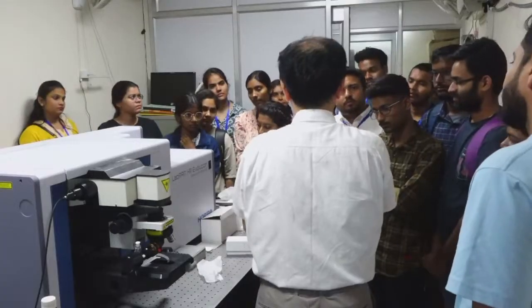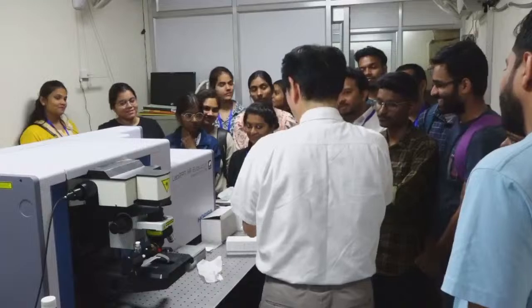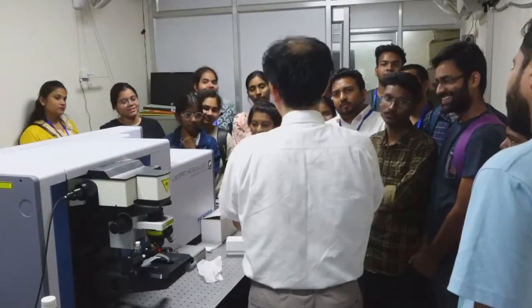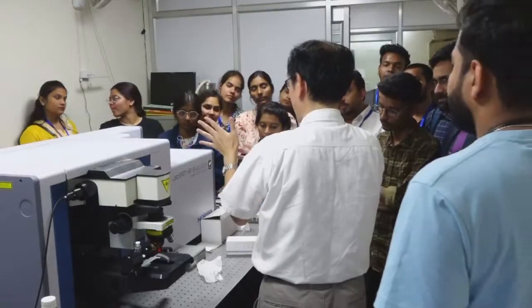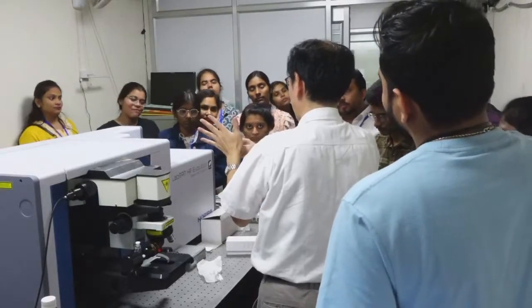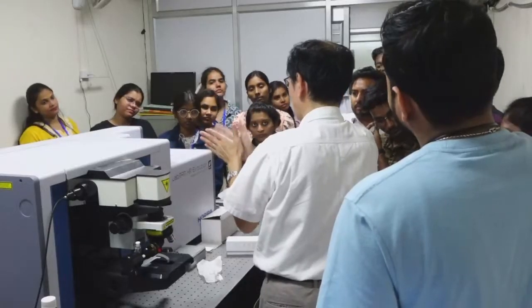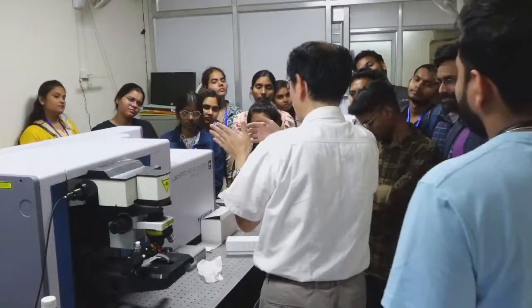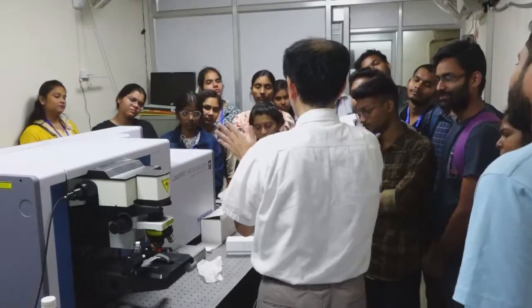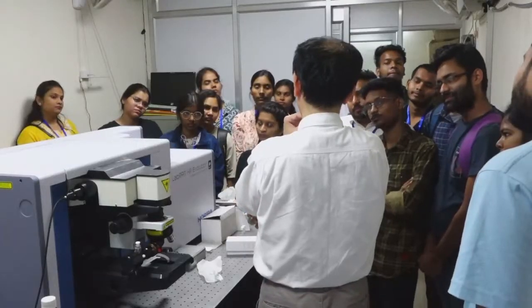So please ask the company. They try to improve it. But for example, on the surface of the detector, some reflection occurs. So some anti-reflection coating is put on to make the throughput higher. And I'm not sure.